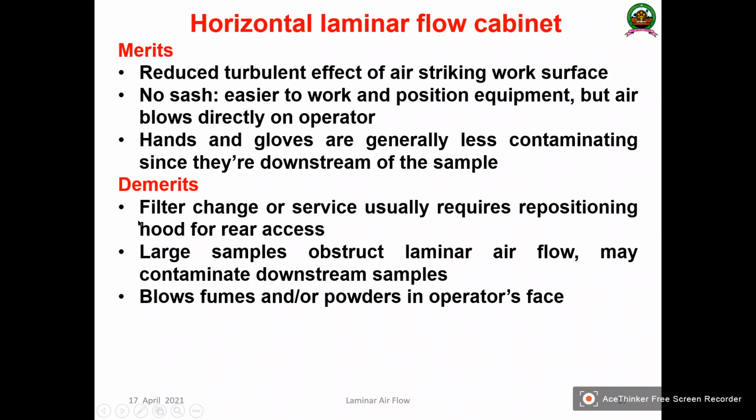The disadvantages are that filter changes or service usually require repositioning of the hood for rear access.